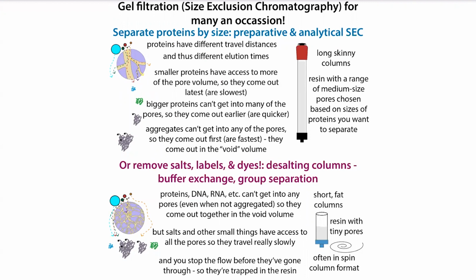And so this comes into play with this technique called size exclusion chromatography or gel filtration, where we have these little beads, and we can have these beads made up of agarose. And we call it gel filtration because basically these are little tiny gels. You can think of them kind of like little agarose gels, but in these bead forms. And then you have these columns filled with beads, and you can have big columns and little columns. And basically, these beads have different meshing niches. And the big molecules, they can't fit into the smaller tunnels, those smaller holes in the mesh. And so they get to go around the beads, and therefore they have a shorter path. Whereas the smaller molecules, they have to go through all those pores in the beads, and therefore they're going to travel slowly and they're going to come out later.